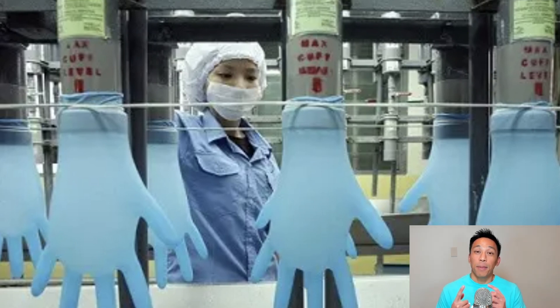This includes puncture tests, durability stretch tests, and more. And the most important test is the biodegradability test to make sure that your gloves indeed break down. This isn't just about greenwashing — this is actually ensuring that the product isn't going to end up in a landfill for 500 years or more.